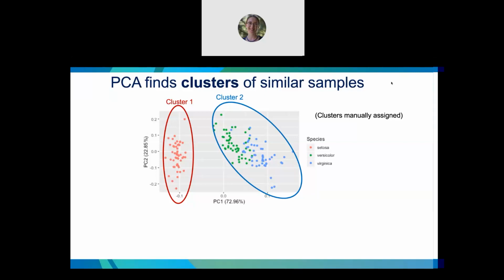Felix says, I'm more used to PCA, but do you use t-SNE as well for visualization at GeneLab? I've heard it's popular in bioinformatics. So, Amanda, feel free to jump in. As far as I know, we don't currently use t-SNE for visualization, but we will when we have a pipeline for single cell RNA sequencing analysis, which is something that the interns are going to be helping with this summer.